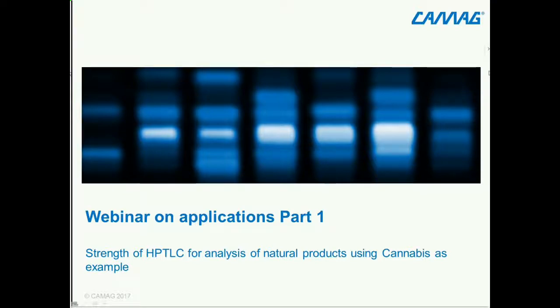Today we will have the first topic, strength of HPTLC for analysis of natural products, using cannabis as an example.